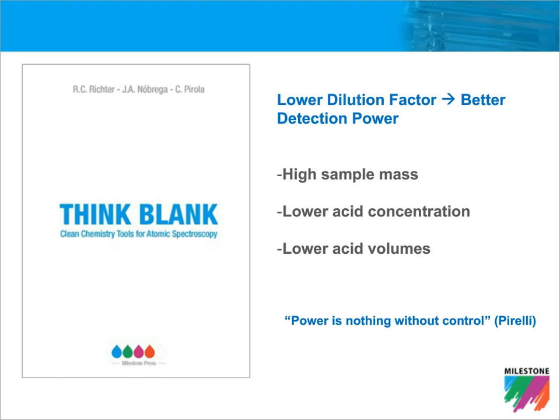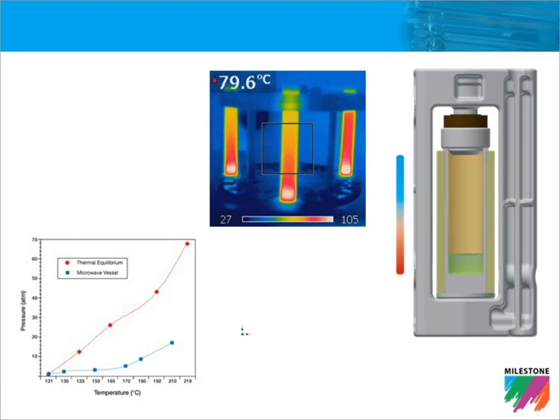We also discussed how the microwave-assisted heating promotes a gradient of temperature inside the reaction vessel, and how this aspect improves digestion conditions and allows a better control of the increase of pressure. The point here is that microwave radiation interacts with solutions containing ions and dipoles, but interaction with vessel material and vapor phase is poor.